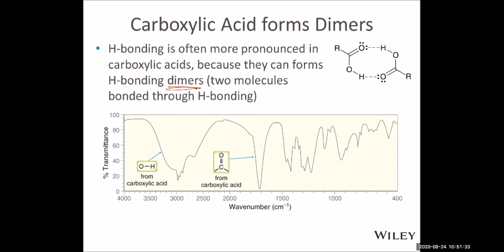And so with that, we can just determine what wave numbers there could be absorbance. They start from the high wave number, around 4000. We first look at this. This should give us an absorption around 3300, and very wide, because two such carboxylic acid molecules can form hydrogen bonding. So we should expect a wide and strong absorption around this wave number.